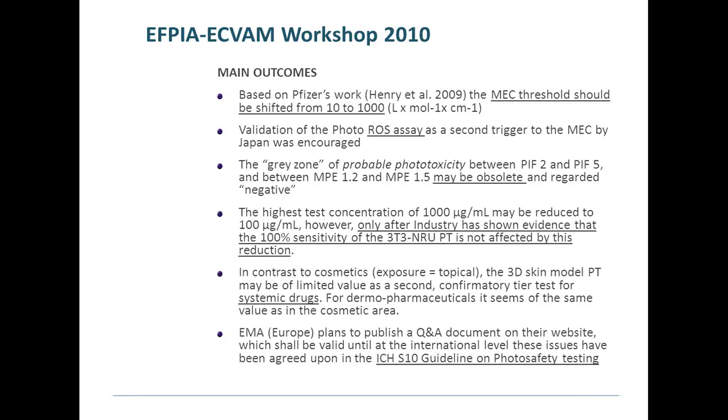Based on the data shown for the photo-ROS assay, it was regarded as a promising second trigger in addition to the MEC, probably even better than the MEC, which was very interesting, although in theory ROS is not generated by all mechanisms of phototoxicity that we know.